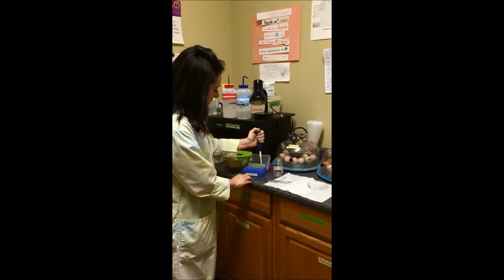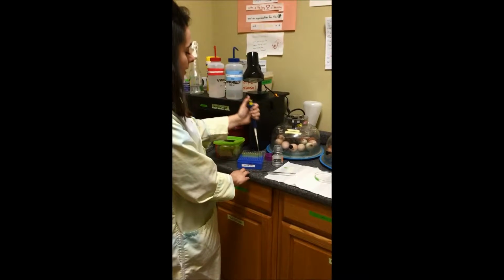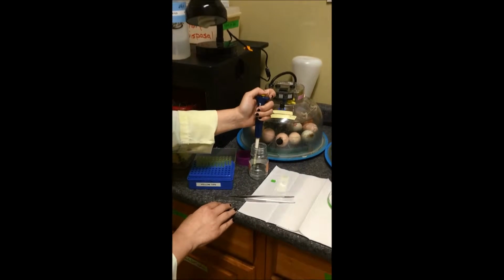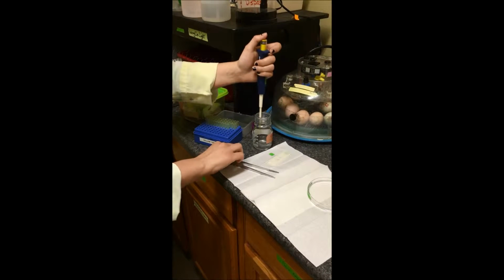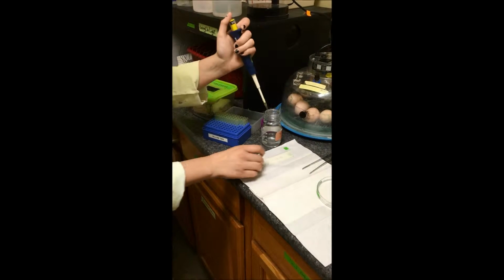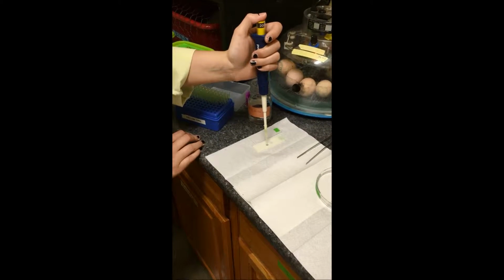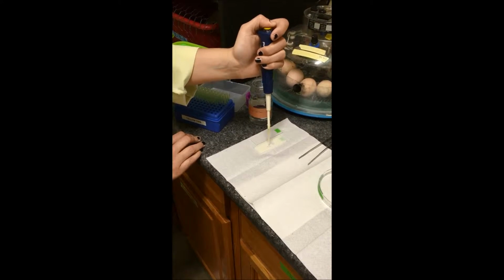Alright, so this exhibit is for our termite guts, and this one we have out in the gallery you can look at termite guts underneath a microscope. What we do in the morning is we get slides ready that have termite gut bacteria on them that we have to extract from the termites. So first, what we normally do is use this really cool solution that is mimicking kind of the environment that the termites' gut bacteria live in.